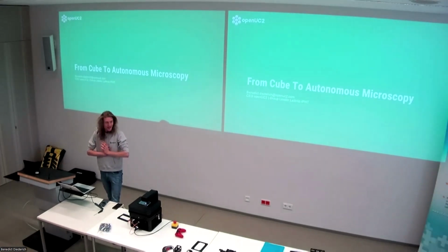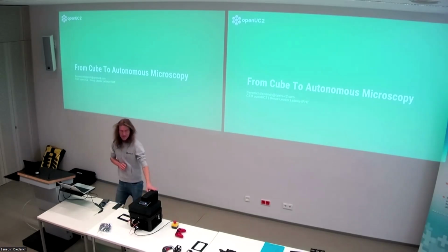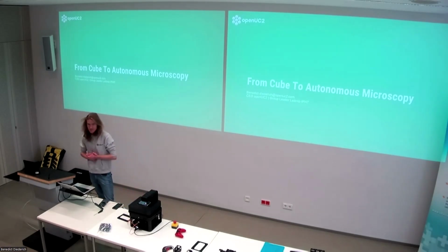I would say we had already a little warm-up release party of the frame, but I'd say it's not quite done yet. So all the feedback you have today is very valuable for us to integrate in the future. We're still iterating to have it hopefully published by the end of this year, beginning of next year.